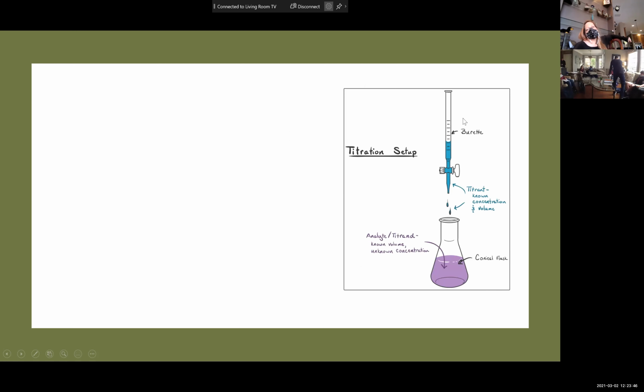So titration. Here's what we did today. Today we did back titration and we did it by hand. This is why we use burettes, because by hand is a pain, isn't it? Yeah. So Alex, what was your final volume of drops that you used? How many drops did you use? We used 150 HCl and we used 54. 54 sodium hydroxide was what you needed.